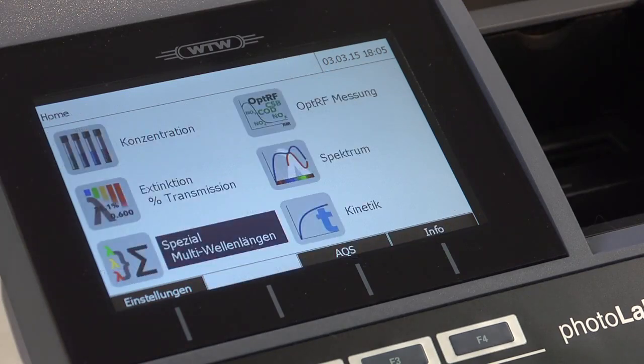Today, spectrophotometers come with pre-programmed methods, and user-specific and complex programs can be defined. The devices are simple and versatile in their handling, and even inexperienced users can achieve good results.